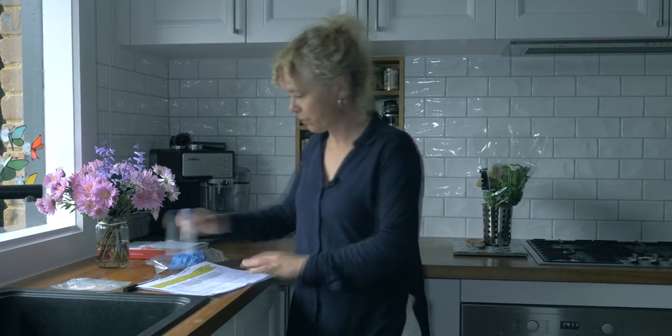And the one thing I do want to write also is whether it's a first flush or flushed sample, and I'll explain what that means. So with the first flush, that means you're taking a sample before you've used the tap. The tap cannot be used for at least 9 hours to take a first flush. So it's the very first water that comes out of the tap when it hasn't been used for at least 9 hours or more.